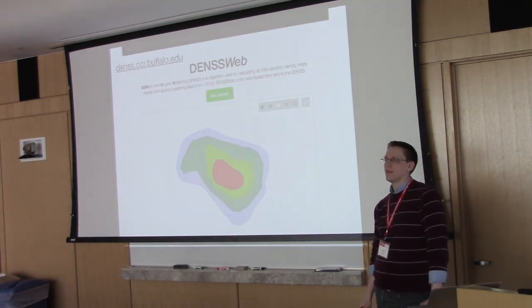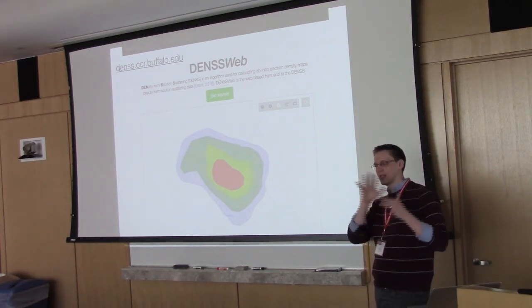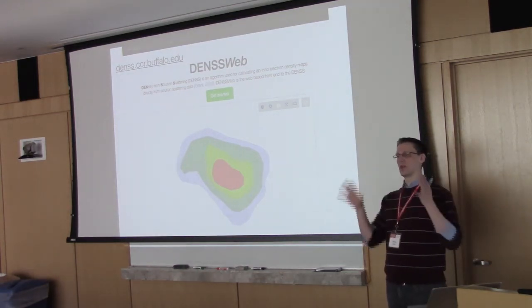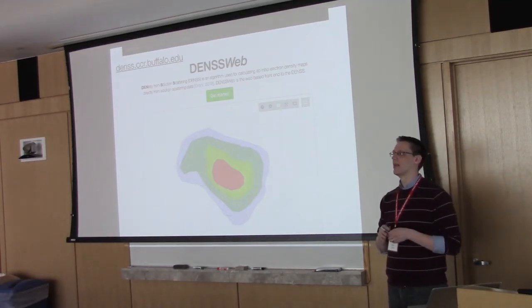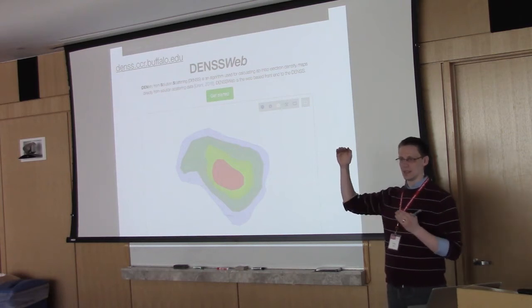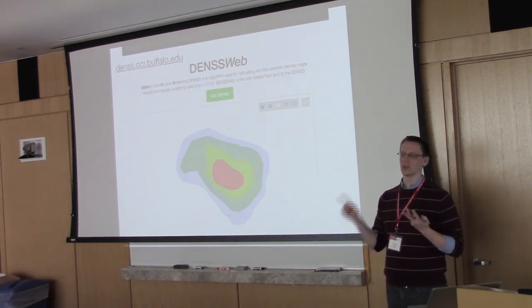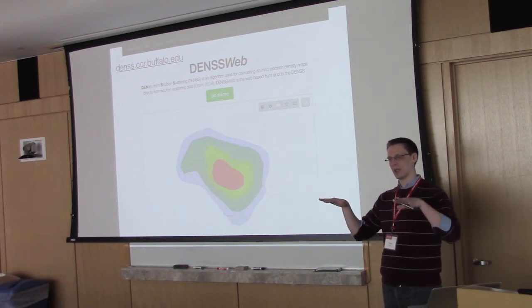Rigid mask. Yeah, so effectively it does a Gaussian blur. If you think of Photoshop, you can just click blur Gaussian, and it'll take your 2D image and get rid of all the noisy stuff and just blur it, just like you blur a camera lens. And then it says, okay, what's the maximum intensity? And it says take 20% as your threshold. These are all editable parameters. You can change the threshold and all these things. So you set your threshold to be 20%.